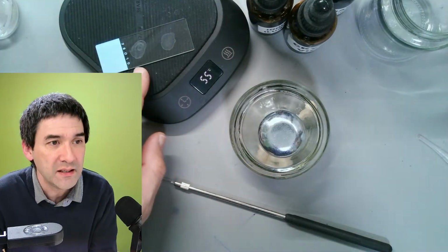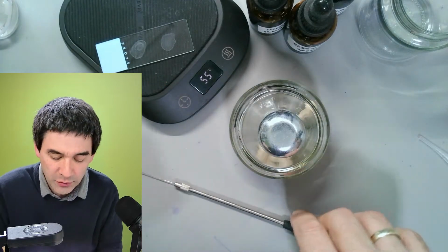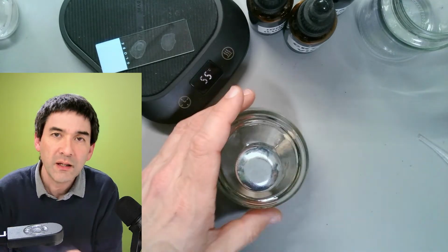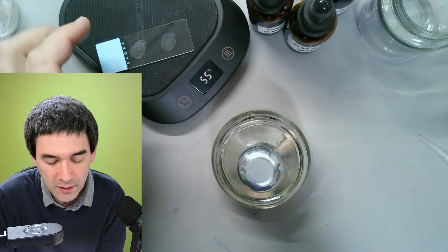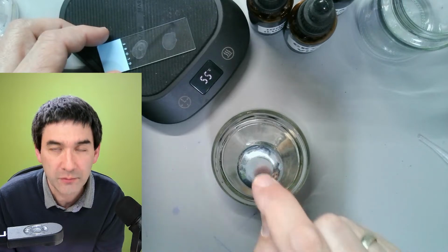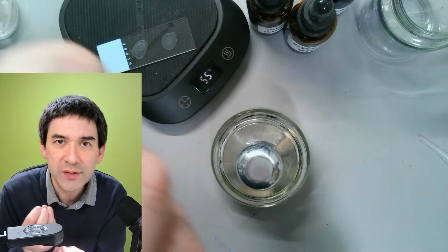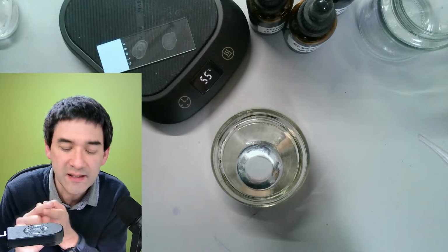So this one now basically seems to be completely dry, and this means that I can now do the heat fixing, and the heat fixing is important. First of all, what does the heat fixing do? I will now pull the slide specimen on top away from the flame. I will pull it through the flame of the alcohol burner a few times, because this will not only kill the cells, but it will also stick the cells to the slide.